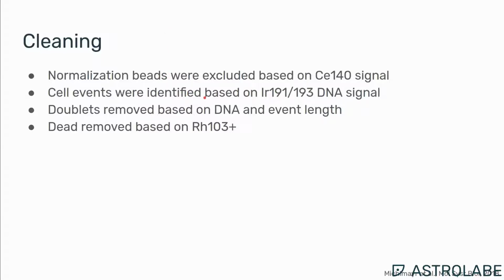They identified cell events based on DNA signal and event length, and then they removed dead cells based on rhodium 103. So for anyone who's done CyTOF, these are pretty clear and pretty straightforward. It's really the standard for cleaning that kind of data.